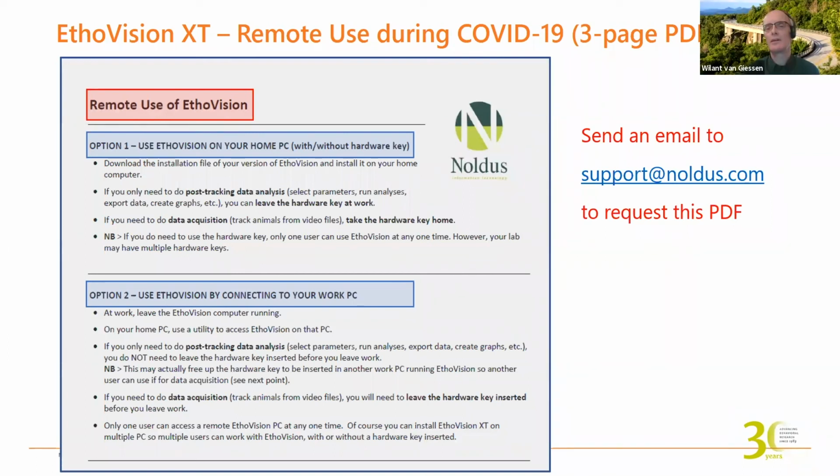Well, if you can still track all your animals the way you did before, if you're talking about having an analog camera from the earlier version, then there are some advantages of switching to our new Basler camera. It's high resolution, so you would have more pixels at your disposal, so maybe you could put more arenas under the same camera, things like that. And it's just clearer.